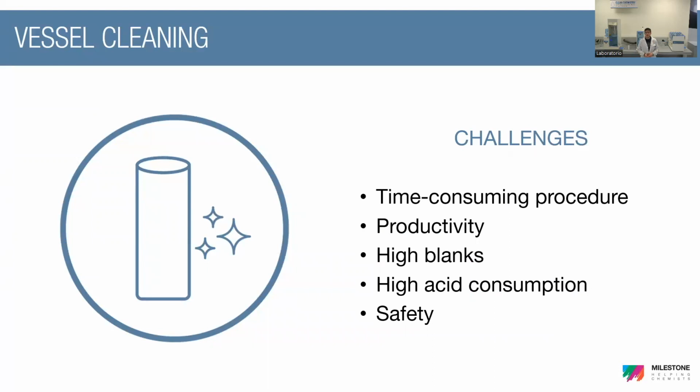Of course, most of the time it's an unsafe approach, with the direct exposure of the chemists to the vapors. And of course, it's not completely efficient.